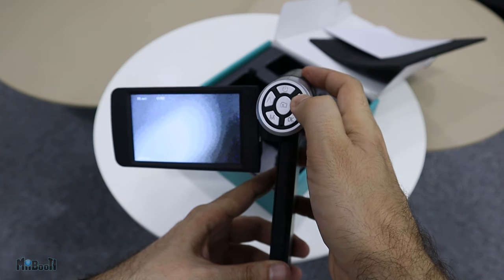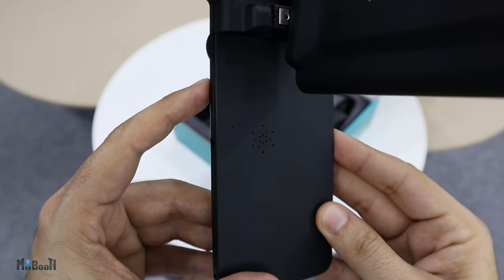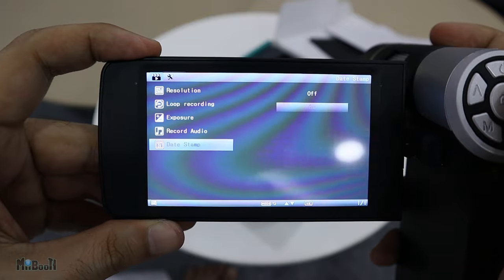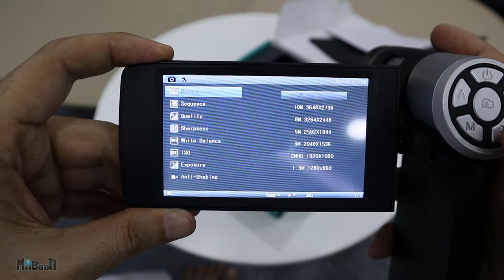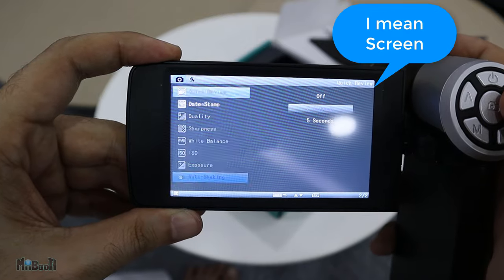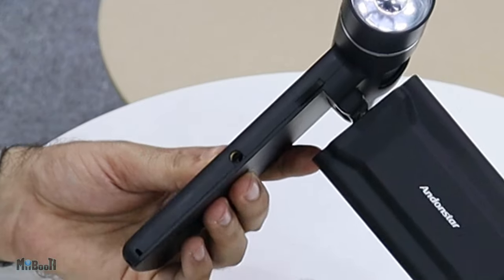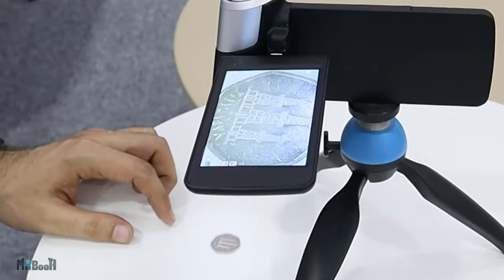It records up to 1080p, so that's good. There's a microphone in it as well in case you want to document videos with commentary — in case you discover a new species of microorganisms or an insect maybe. And there is a speaker too. Additionally there's a ton of settings for video and picture mode separately, like the resolution, quality, white balance, exposure, and stabilization. The scene is quite clear and crisp — not grainy and low quality like I've seen on some products before. If your hand is shaky, there's a spot for a tripod screw so you can set it up and use it like a tabletop microscope.